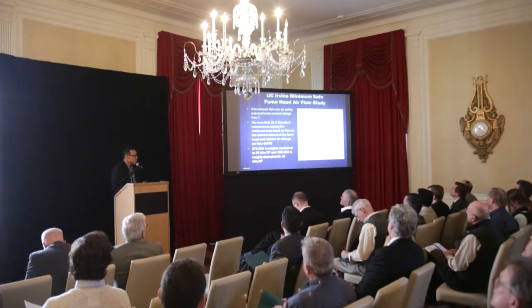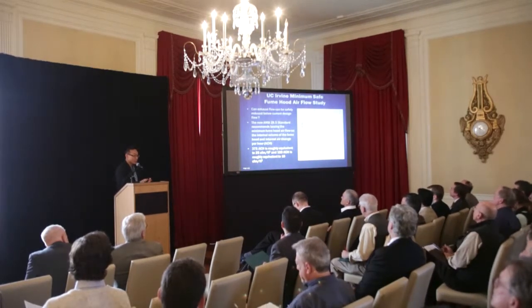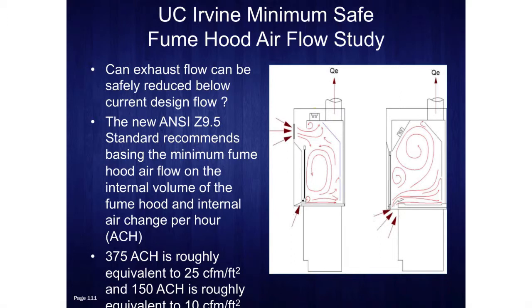Without getting too much into the details of what the standard says, that was the point of the study, to see how much we could reduce the fume hoods below the current design minimum of 25 CFM per square foot of work surface. That's probably what all your fume hoods are set at as well, because that's not just a California thing.